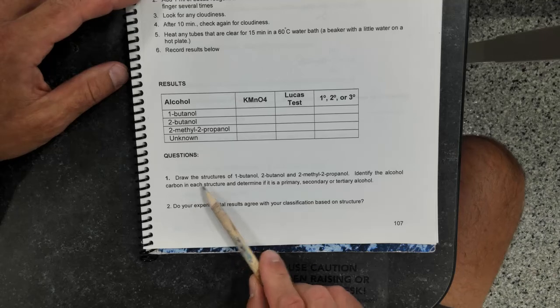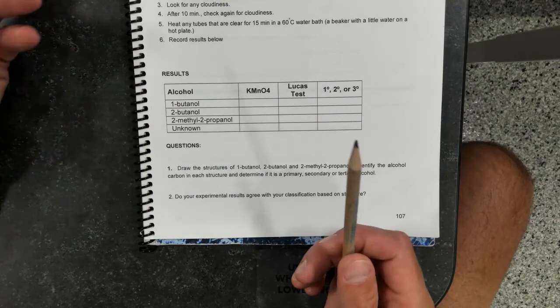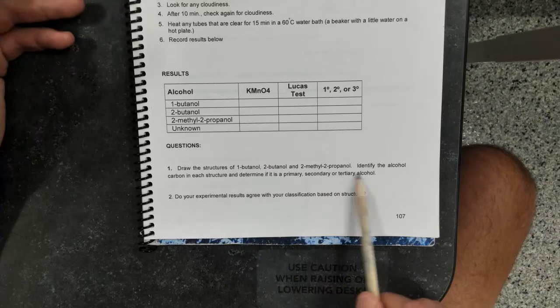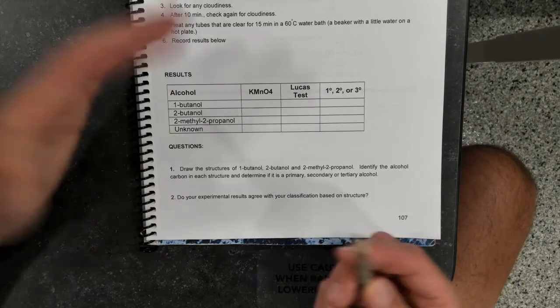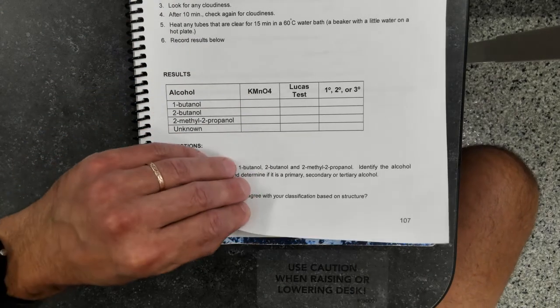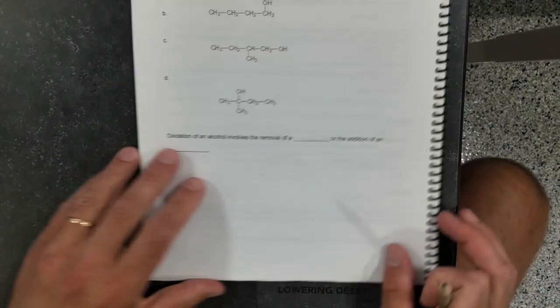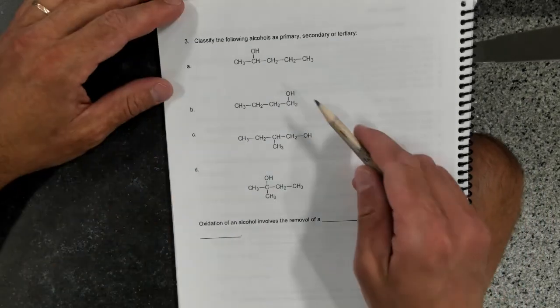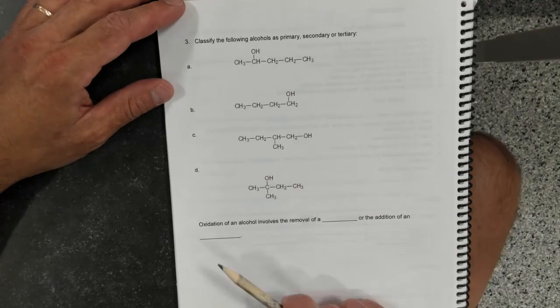You should draw the structures of these chemicals. You can Google it and figure it out. You determine if it's primary, secondary, or tertiary. I kind of gave it away. Our experimental results, it's up to you to judge whether they agree with our classification. And then you should classify the following alcohols as primary, secondary, or tertiary based on the structure.